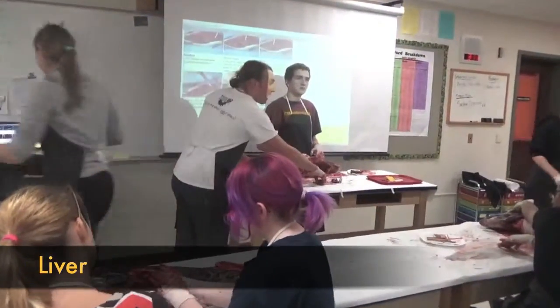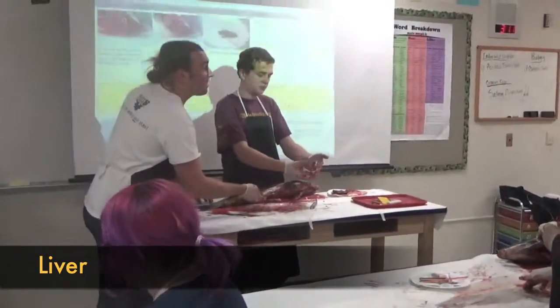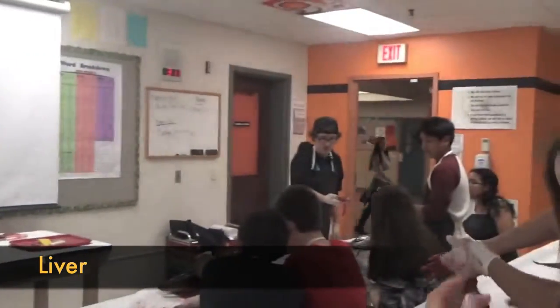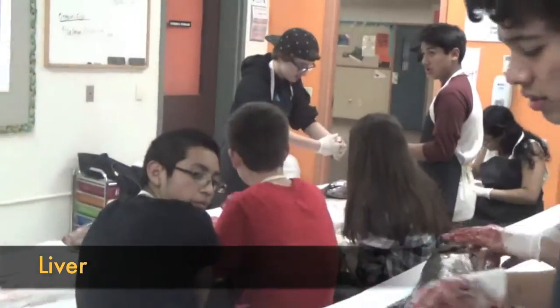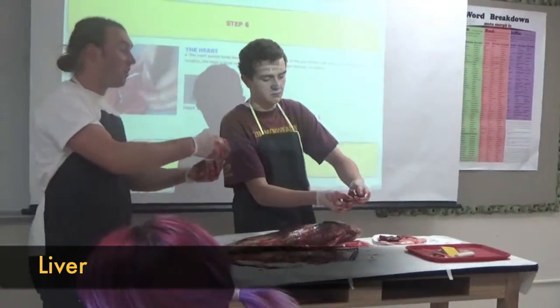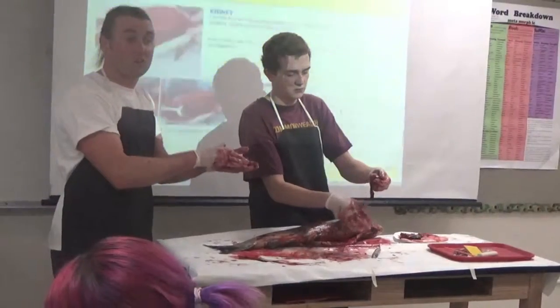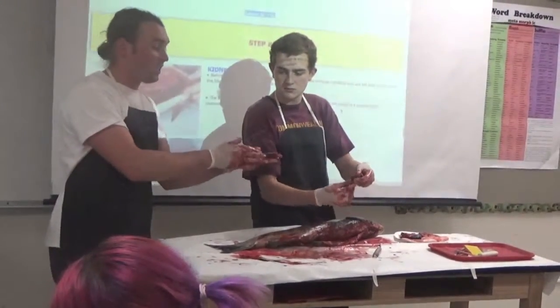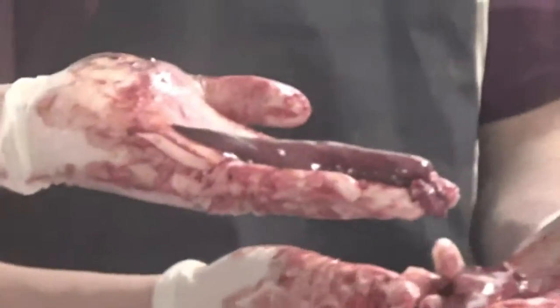Someone asked what is the liver. What is this? That is the liver. The liver is the biggest organ in that body. There are actually two parts to the liver in these fish. Brandon and I have two pieces of the liver here.